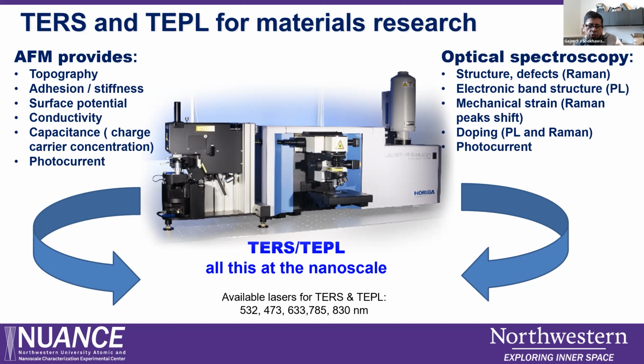It also allows you to do Raman spectroscopy at low wave numbers. You can go down to five wave numbers, so you can start seeing also the metals. Then it has 4 different lasers, and it's a fully integrated system. So you can do AFM and Raman simultaneously, or AFM separately, or Raman separately. It has integration with different detectors, so you can do PL up to 1.6 micron. That system we will have in a couple of weeks, a couple of months.